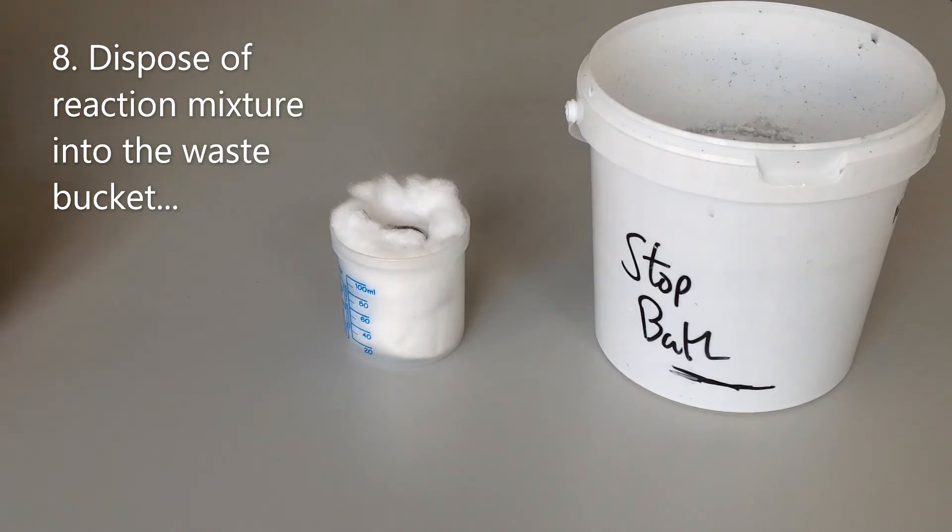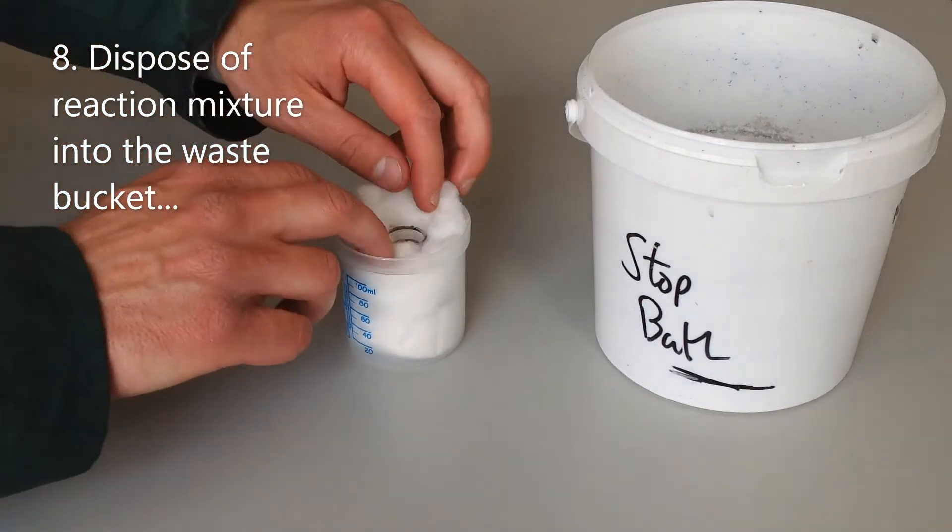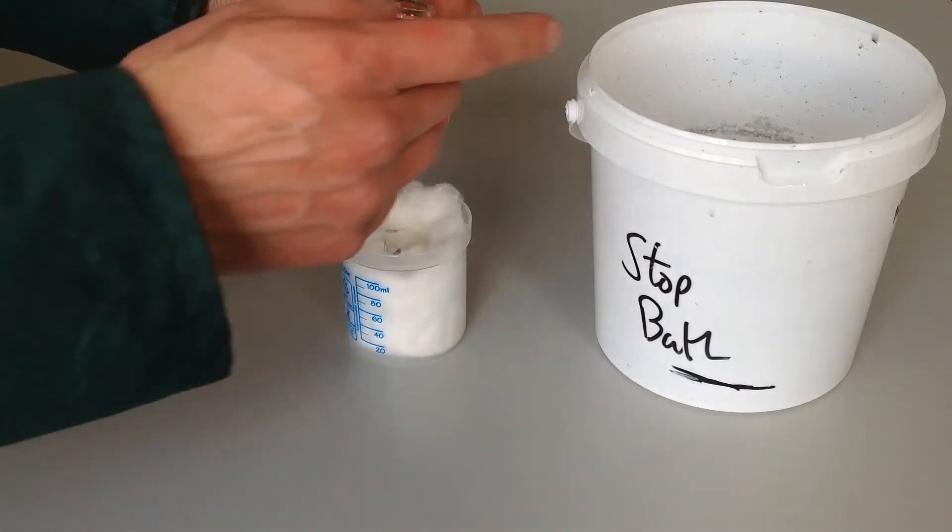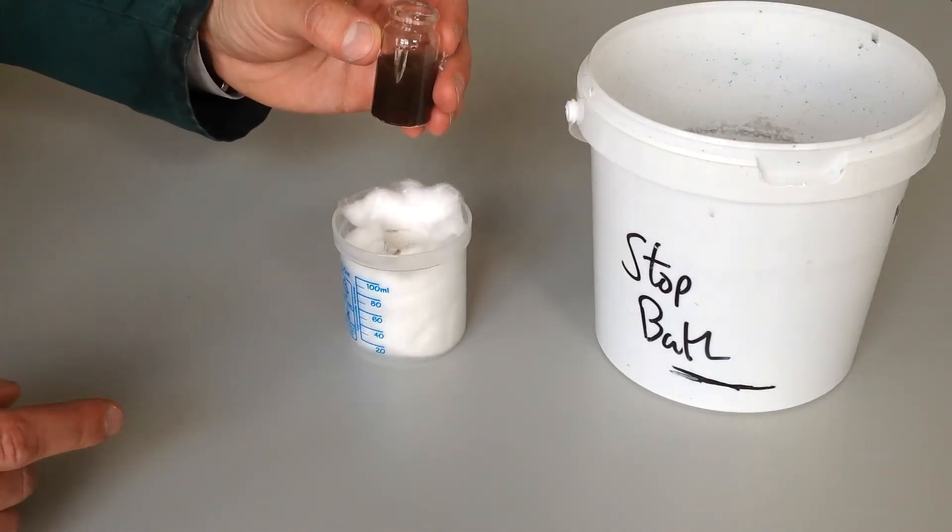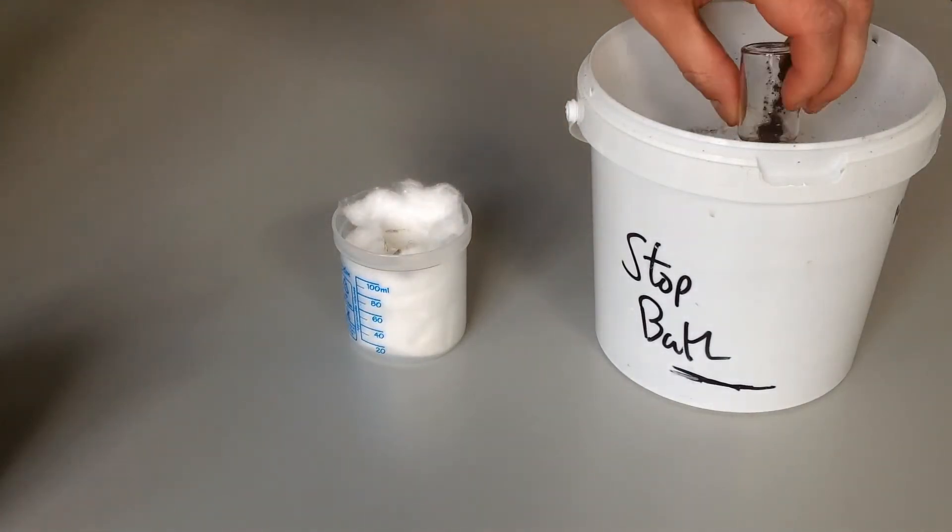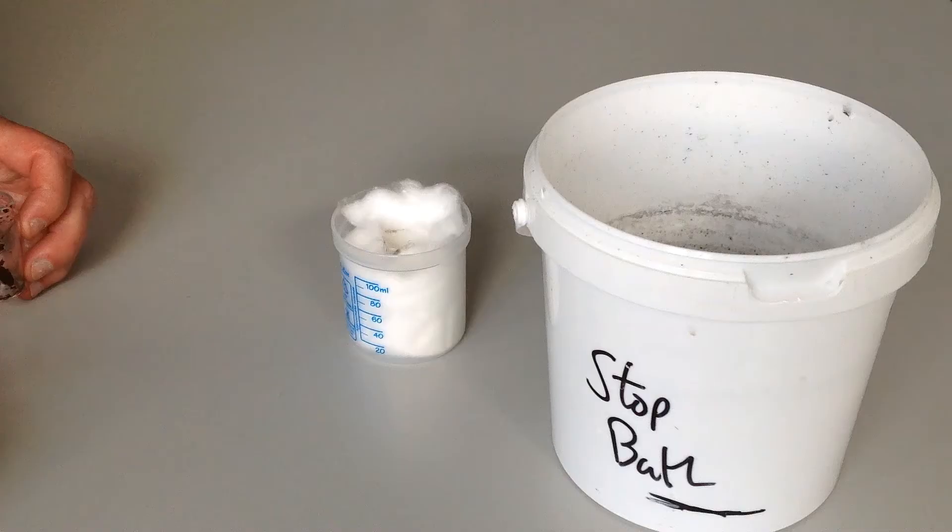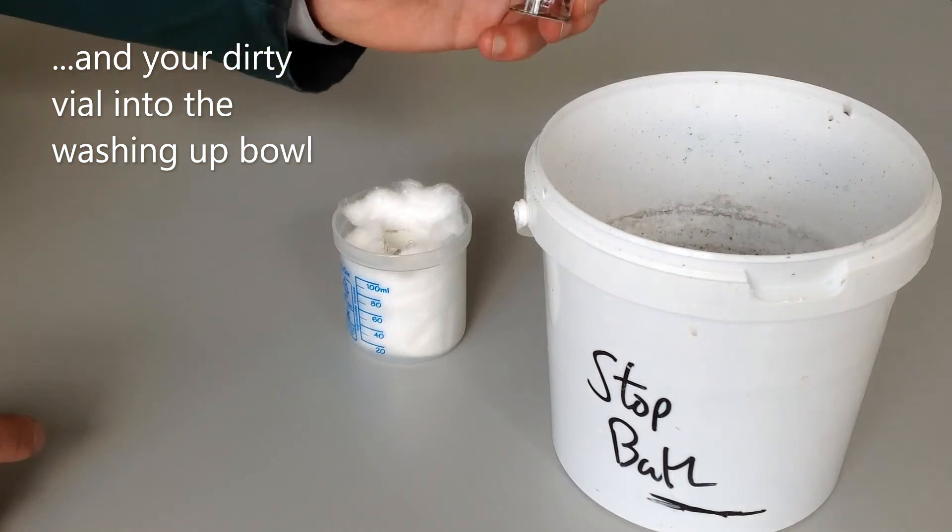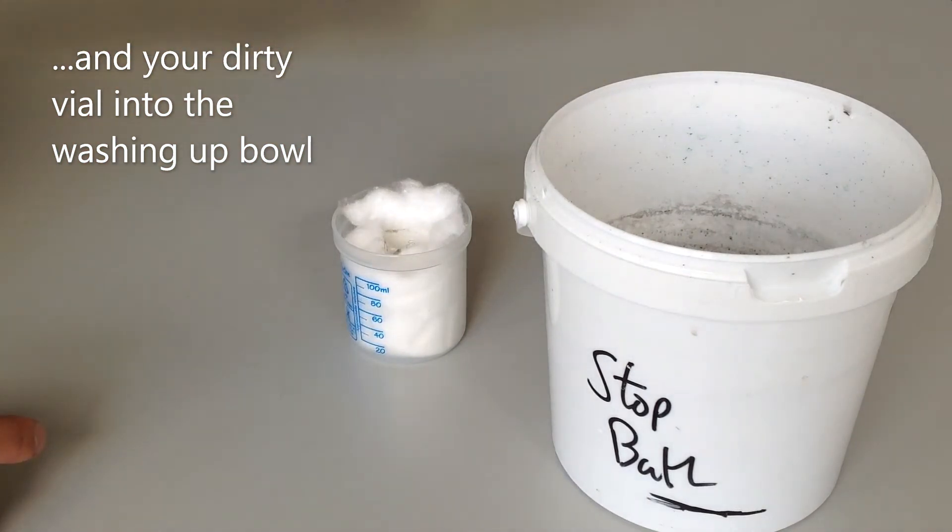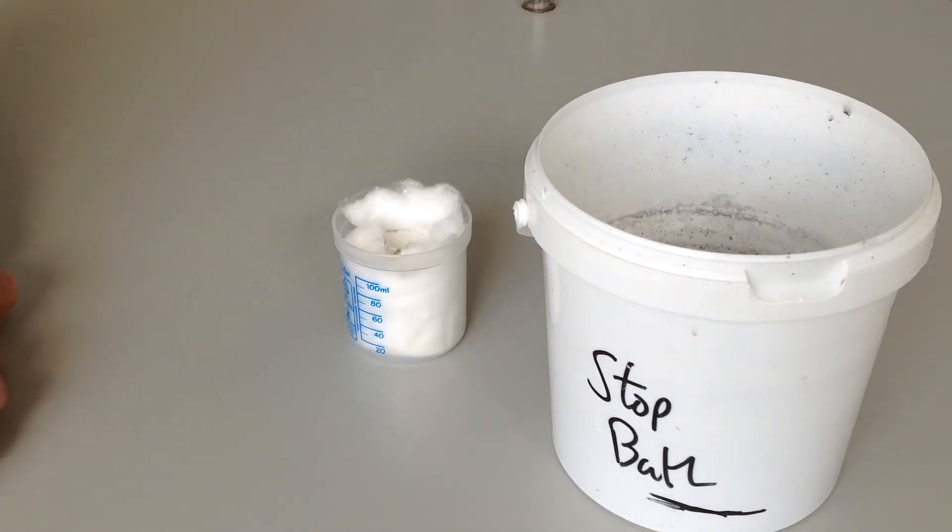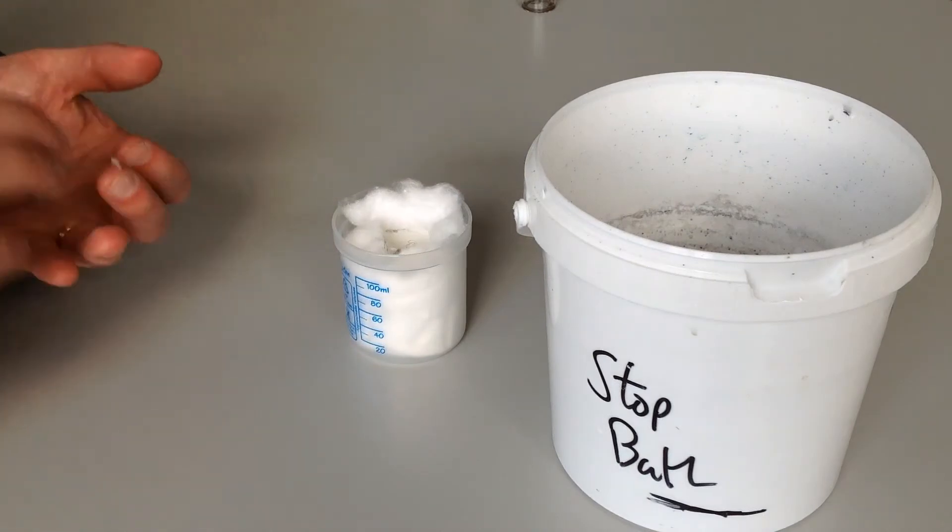Once you've got your final temperature reading, you should be able to just carefully push the lagging down, bring out the vial. You'll have a waste bucket on your bench. It looks a bit like this. I'm just going to pour your whole mixture through there. Once you've put your reaction mixture into your waste bucket, you're going to then put your vial into the washing up bowl that's on your table, and then you'll be ready to start the next experiment. Before you do so, make sure you've recorded your initial and final temperatures.